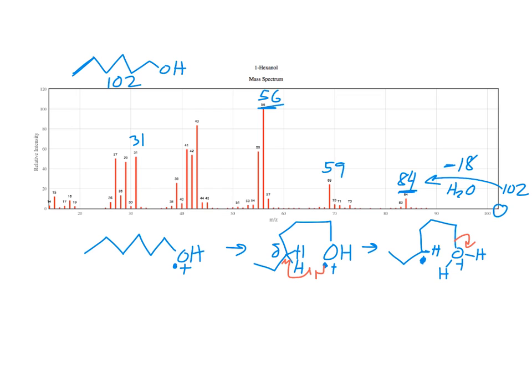And then it loses this water molecule, plus H2O. So this should be at 84.